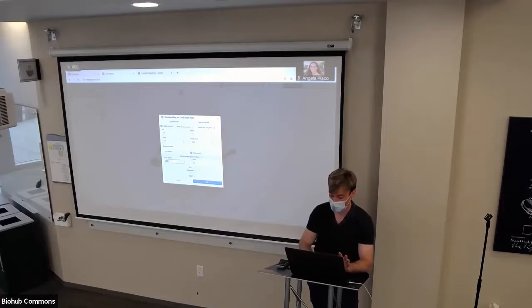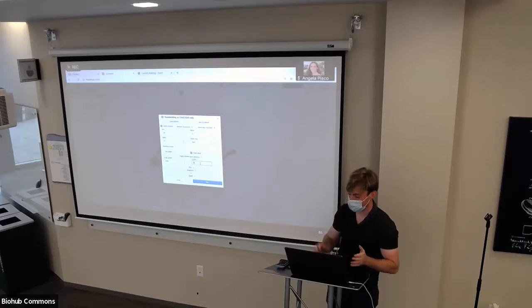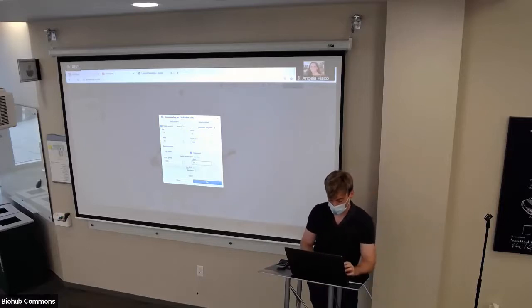All you have to give it is the number of genes that you want to select for, the number of top genes. Again, this will have a tooltip. The number of bins is something you only play with if you know what you're doing. Basically, each gene's mean expression is going to be normalized against the expression of genes in its bin to account for the fact that different genes will have different dynamic ranges of expression. We'll just keep it at 20 bins, meaning it's binning your mean expressions into 20 bins, but that's a little bit more in depth than I want to go. So we'll keep it at 2000.